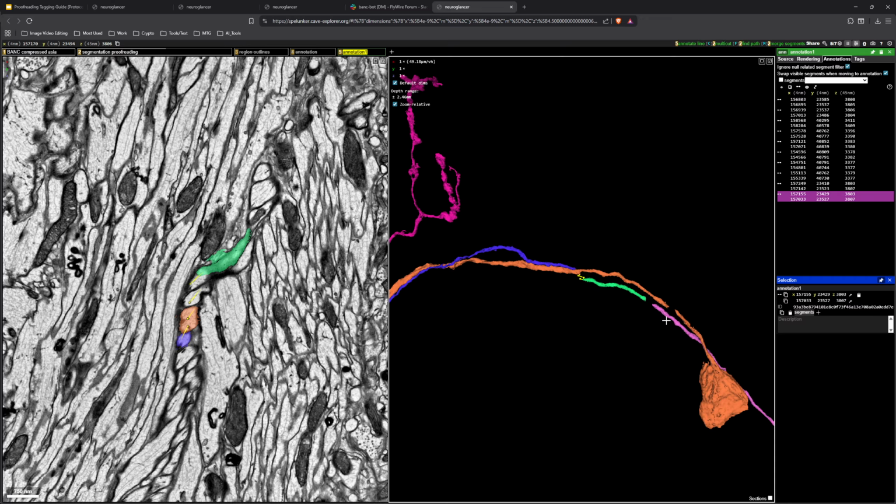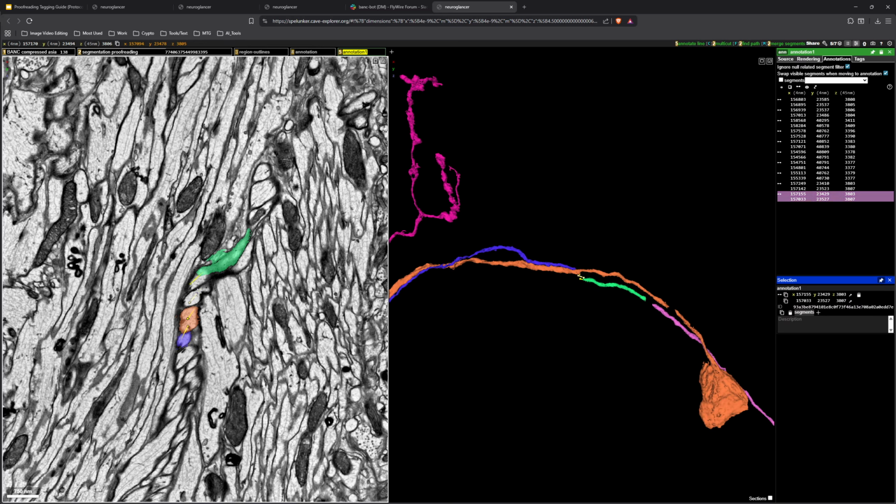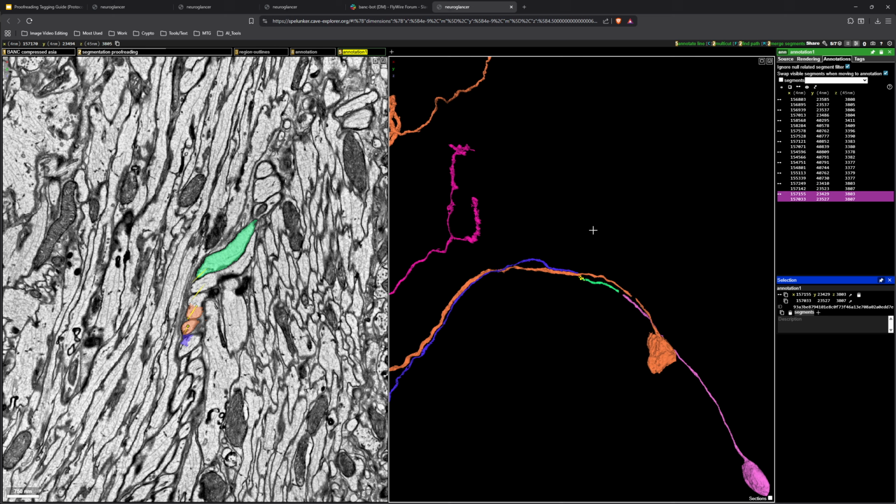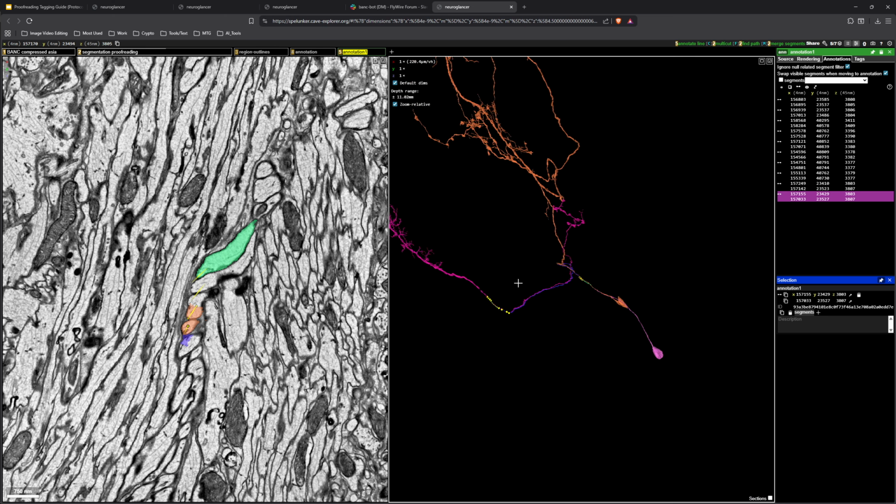So what we have to do is just cut this soma off, cut that soma off, cut this soma off, and then re-stitch this one to here, this one to there, this one to there, and that one, the other orphan, to there. So that's how you would deal with the cascade.